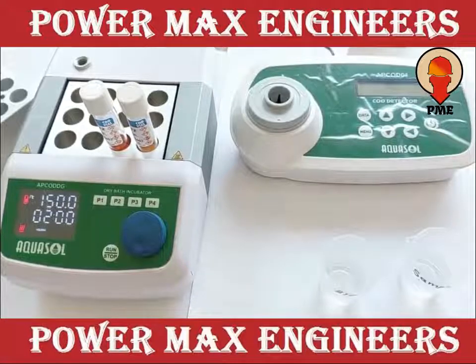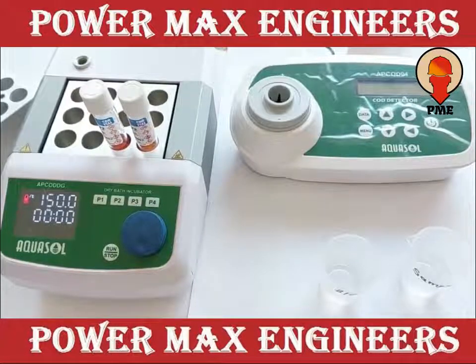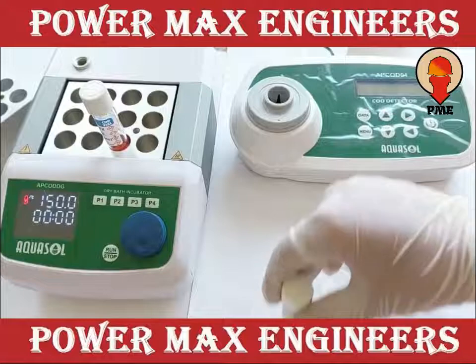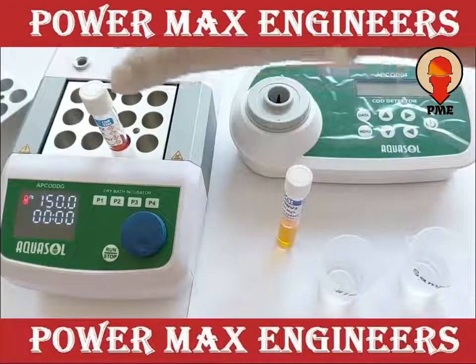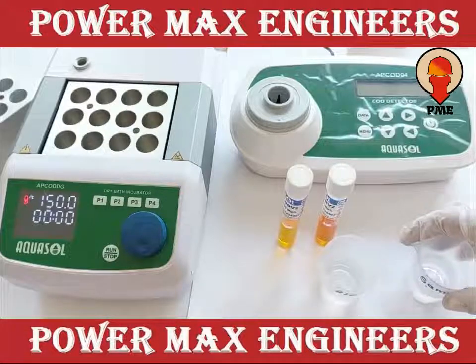After 2 hours of digestion, remove both the vials and swirl the content carefully. Now cool both the vials naturally at room temperature.